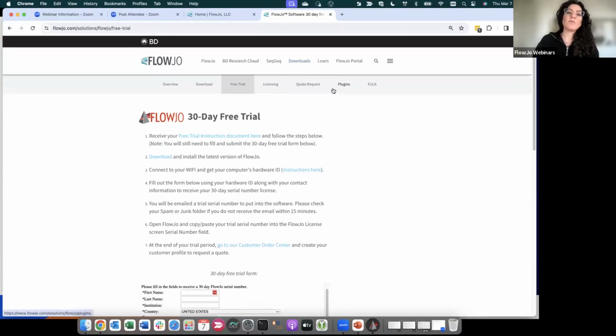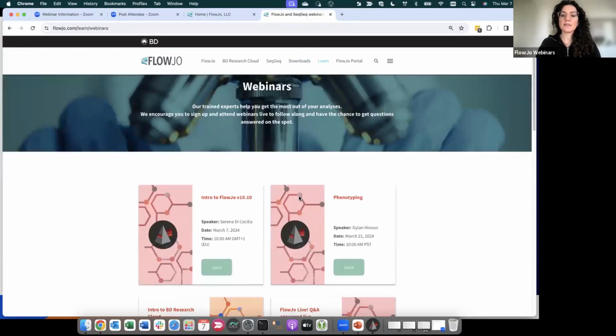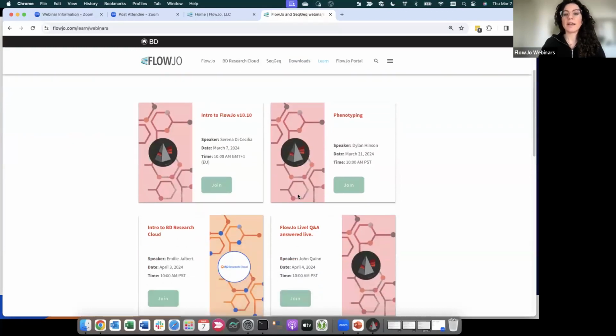The second thing I want to mention regarding the FlowJo website is the Learn area. As I mentioned before, this webinar is recorded, so in case you're missing something, there's no problem, because if you go under Learn, you will find the webinars tab. In the webinars tab, you can sign up for upcoming webinars.